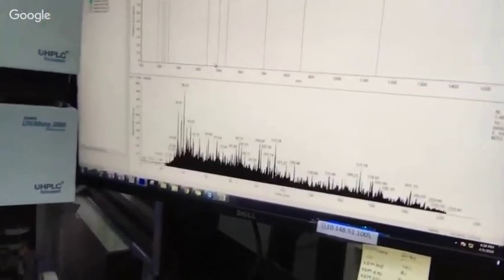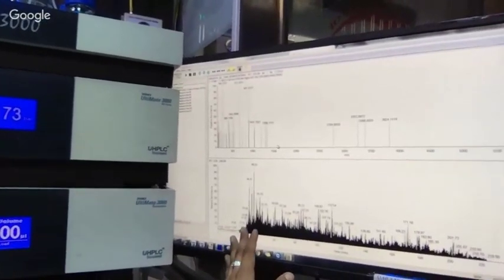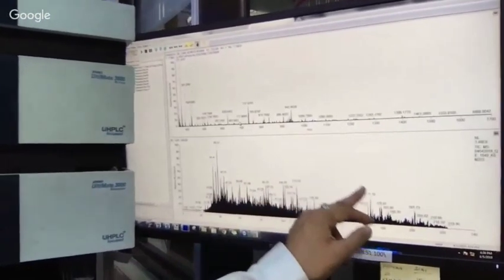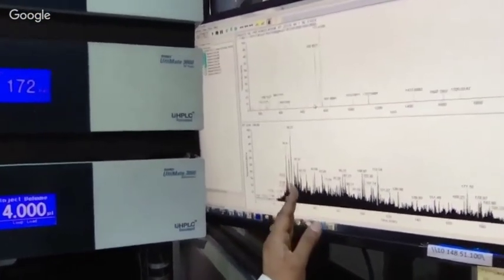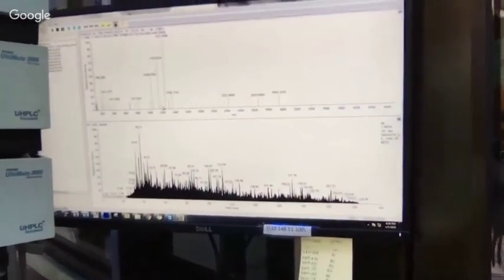So we have a sample running live here. In this case, it is a live run. Actually, it is not a great sample coming in because the pattern is not so Gaussian. We'd like to see something more coming up here and then coming down slowly. But for this long run, you can see many peptides started coming in the very beginning, and then they are separated well over the time period, and now they are coming off. So in this manner, this is what you'd like to see, but this was not for a demo, it was a live experiment run.